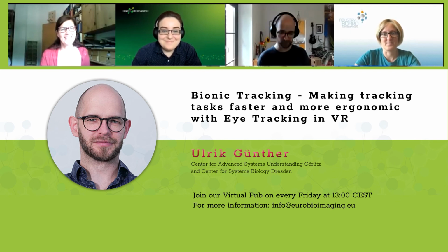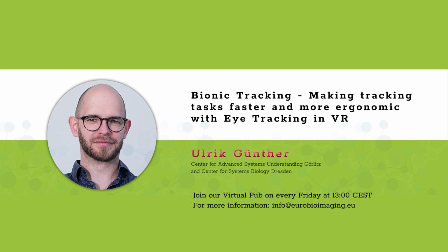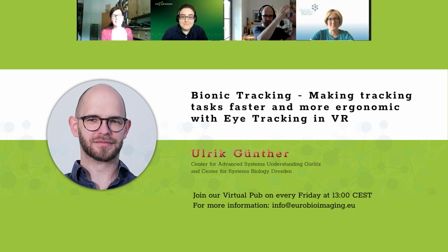because this puts additional mental strain on the user, right? Imagine you are in the situation, oh, I want to do this tracking, I want to be done in 5 minutes. You follow the cell, it divides. What do you do? This is quite a stressful situation for the user. So we get around that entirely by just playing it backwards, and then it fuses, and then you can say at some point, okay, this is now the cell division event, and done. Okay. Thanks a lot. It's a very cheap trick, but it's quite effective.